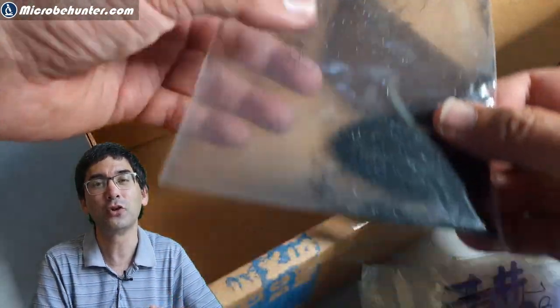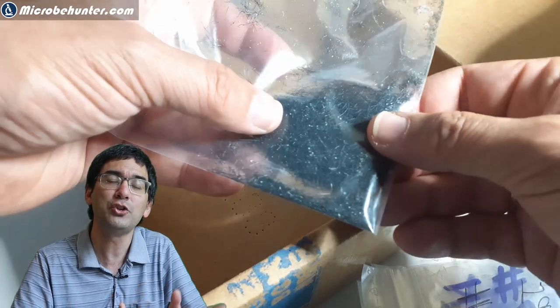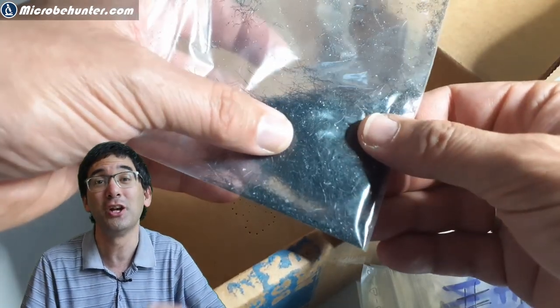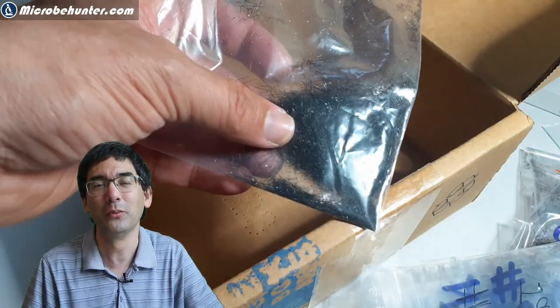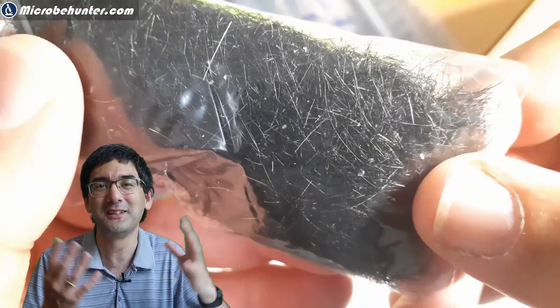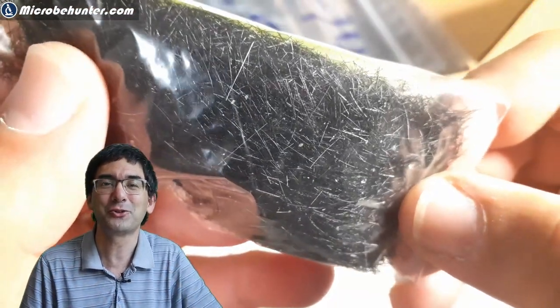You might think that this is strange, but it is a science project that I'm doing because I want to observe if the hair changes as people start to age. So I'm going to wait a few years and maybe I'll be able to see a difference in hair texture and thickness.